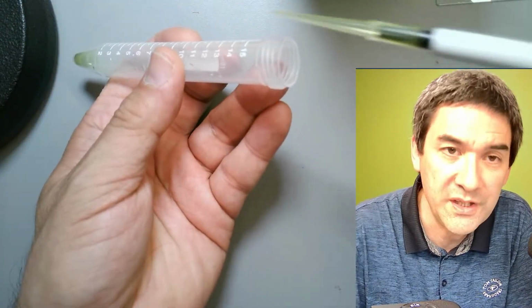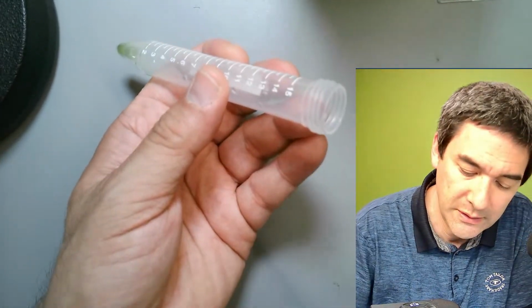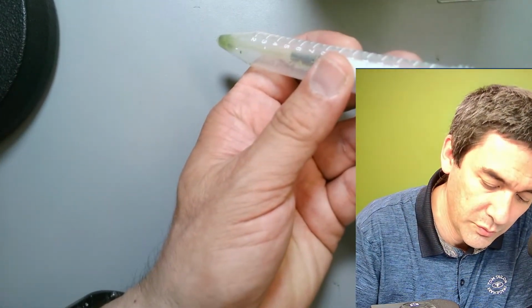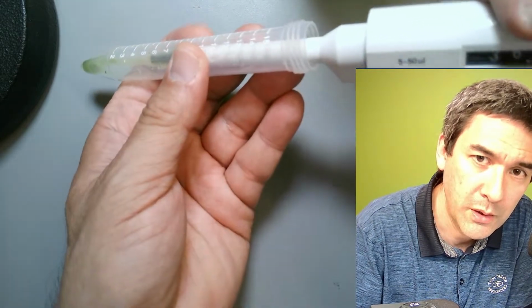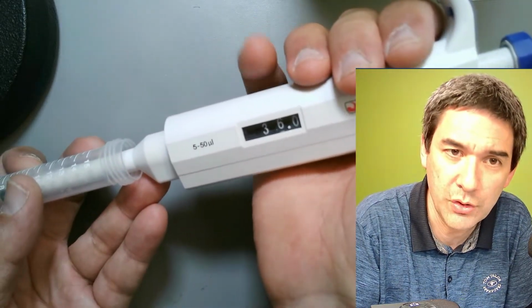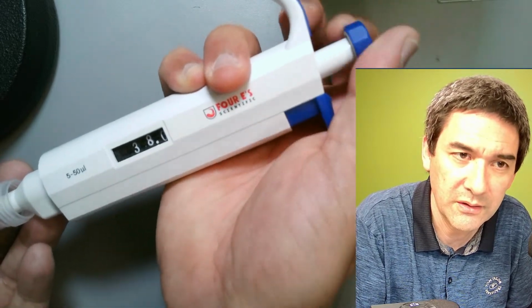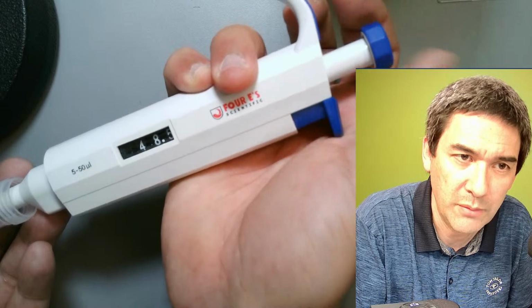That's also one of the reasons why they are very practical, because you can go all the way down and simply mix it by drawing it up and down, up and down. By the way, these micro pipettes, you can adjust the volume, in case you don't know that, by turning this here. Okay, so let's just go to the maximum.